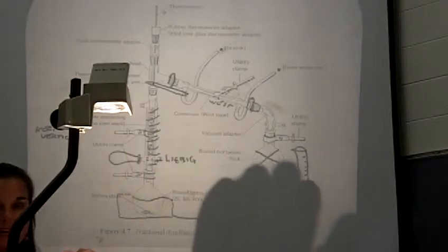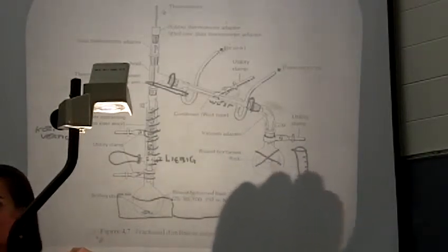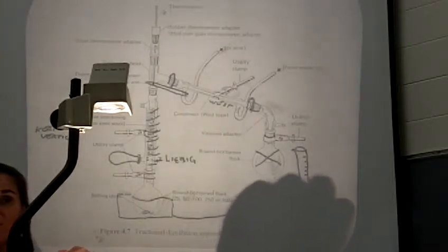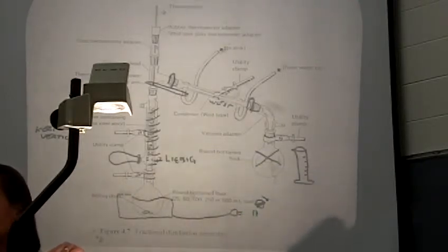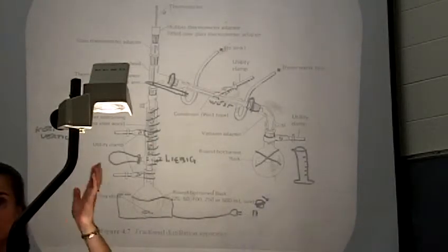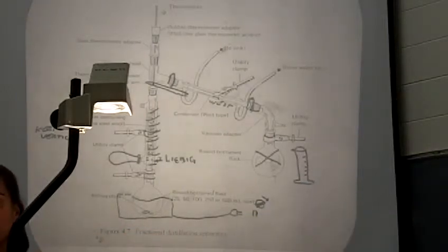Be really, really careful not to take the base of the graduated cylinder off. It is a real temptation because you think you can read the volume better that way. But when you go to set it down on the bench, it's really easy for it to tip over. And so you could do the whole fractional distillation, set it down on the bench, have your fractions spill all over your bench, okay? So don't take that base off of there.